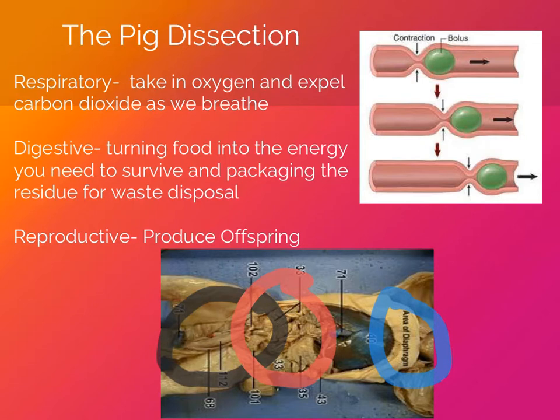Food moves through the digestive system via peristalsis. So this is peristalsis here. It's a wave-like contraction of smooth muscle that's going to push food, or a bolus or chyme, depending on the stage of the digestion, through the system.